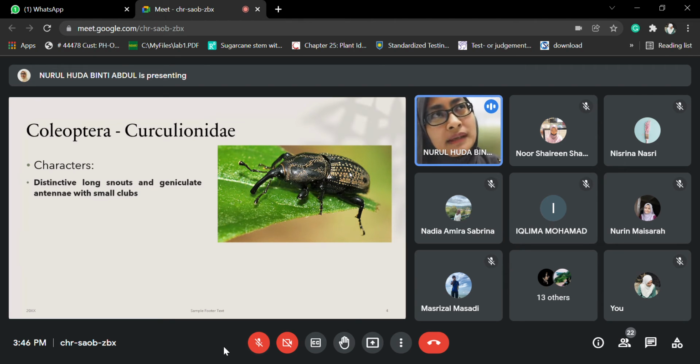So you may skip that kind of characteristic. There are parts where you cannot say whether it is actually pointing backward, to the front or downward. Some of the characteristics are not very clear.